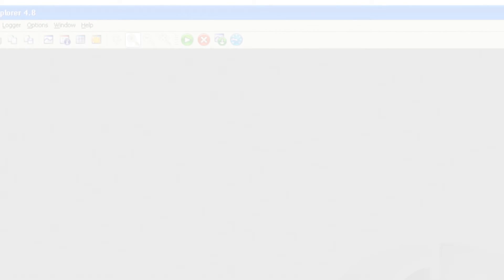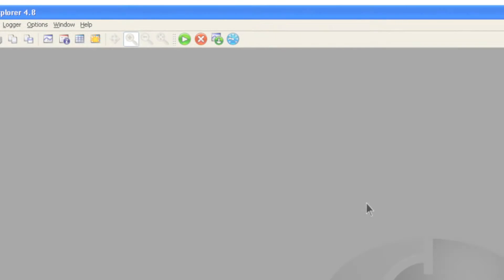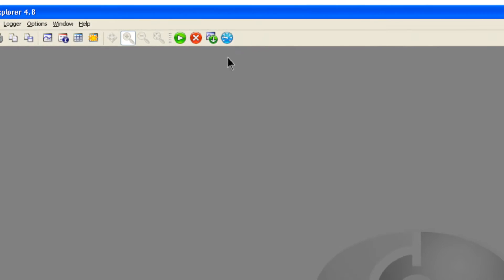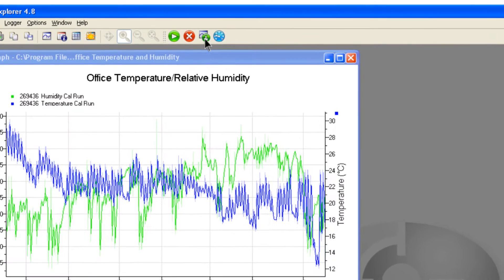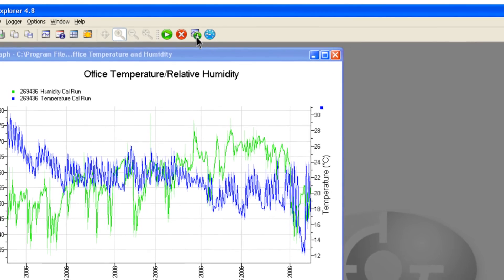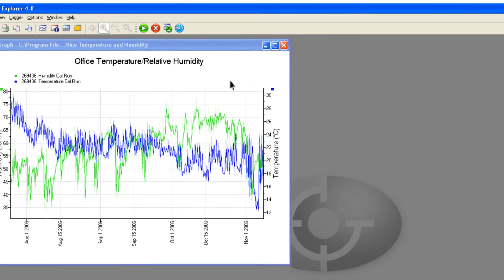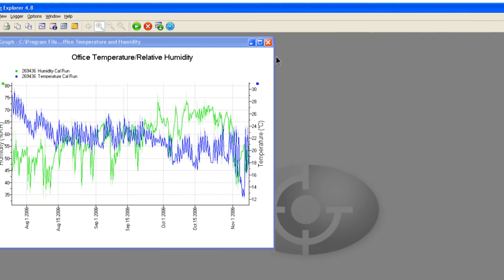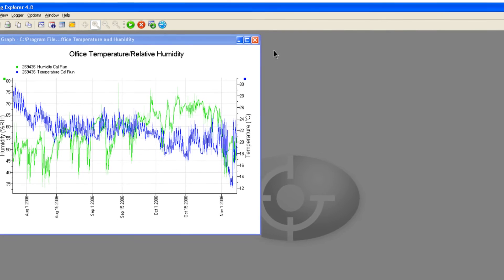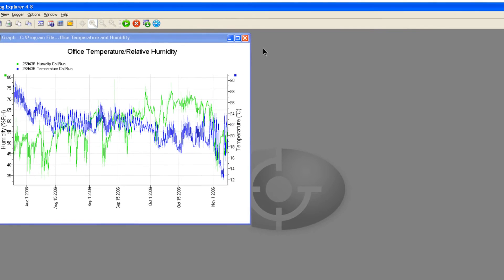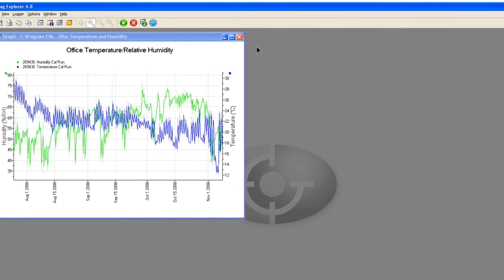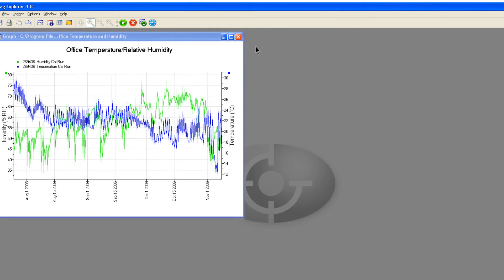When you wish to view the recorded data, connect it to the computer and click the get data option. Data from the logger is initially displayed as a graph that automatically scales itself to a suitable range for the data recorded.